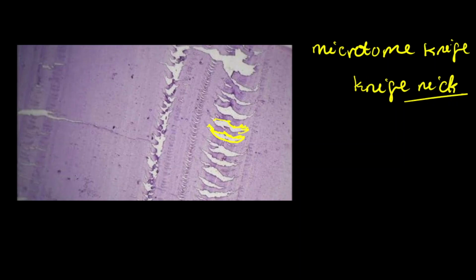Okay, certain part of the tissue is held by forceps, and certain parts are cut by dull scissors. Now, these two instruments could cause some artifacts in the eventual tissue section that is prepared. Okay, so these are some of the unavoidable artifacts that can be created during tissue preparation and tissue sampling.